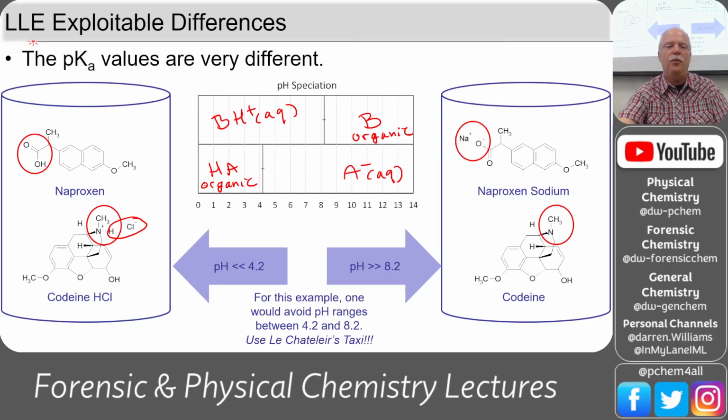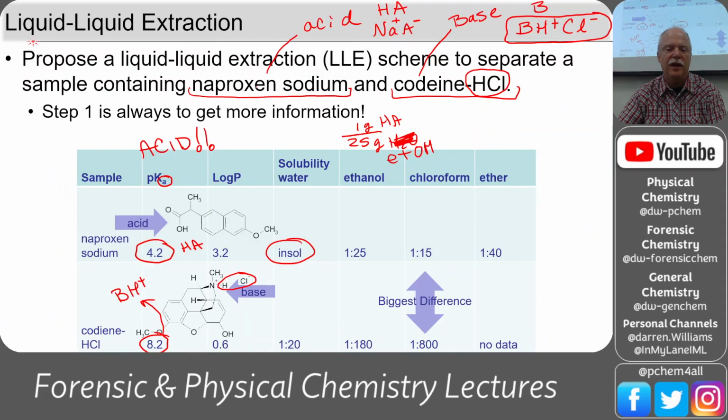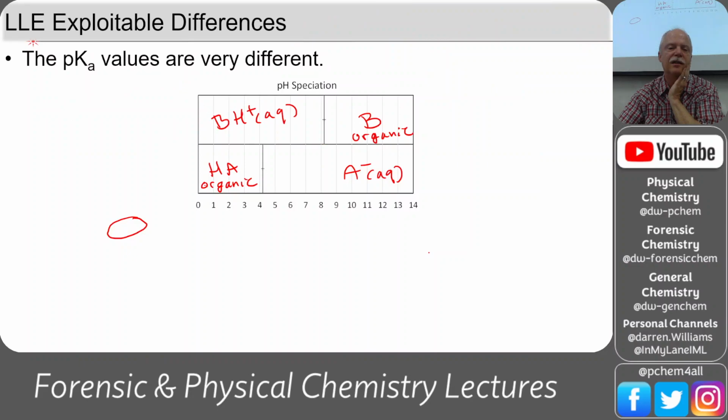So which one of these makes more sense, though? Let's go back and see which one prefers the organic phase. Remember, the naproxen really liked the organic phase. And so let's drive the naproxen sodium into the organic phase. And so that was the naproxen in the organic phase. So it would be this one here. So we would want to be below pH 4.2. So that's how we would decide if we were going to use the low pH or the high pH.